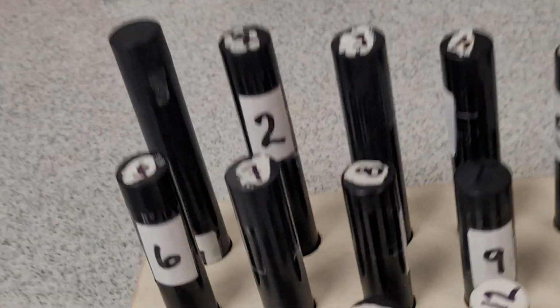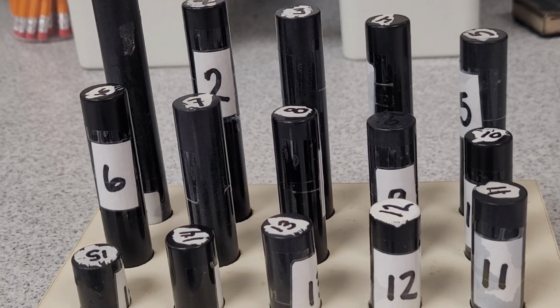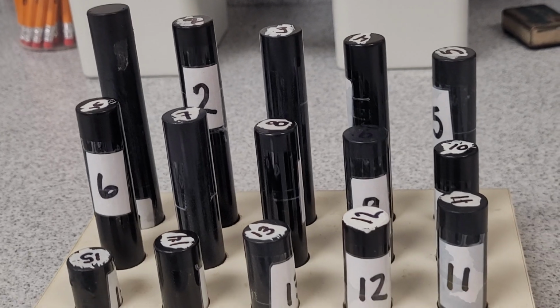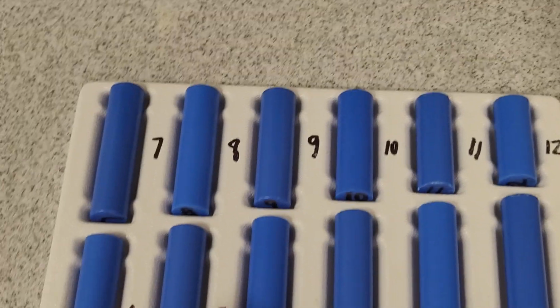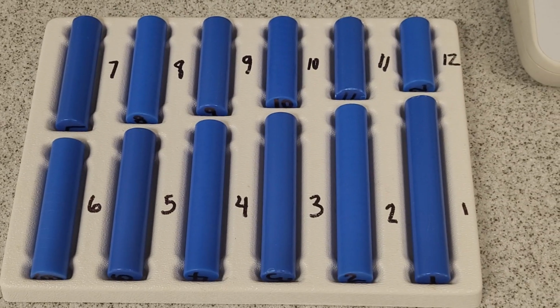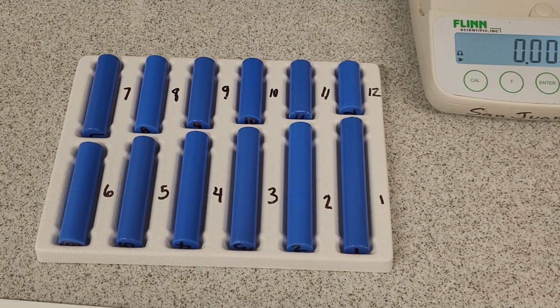So even though all of these objects look the same, so they all look like black objects, there's actually two different types of materials. And you guys have to identify which of those materials are made of the dense stuff and which ones are the least dense. So same with these, if you choose to do the blues, there's two different materials in these blues, and you have to figure out which ones are which. They look identical, so this is more of a math lab than anything.